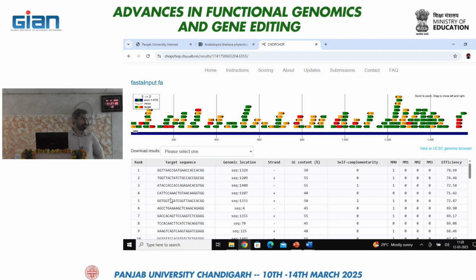Your FASTA sequences should be continuous without any disruptions or any unrecognizable characters.